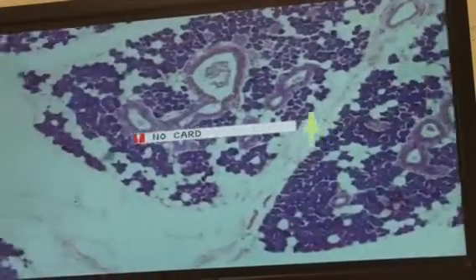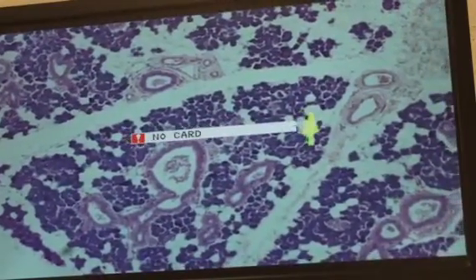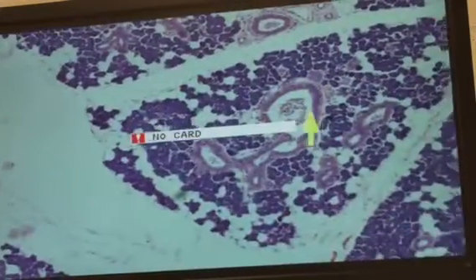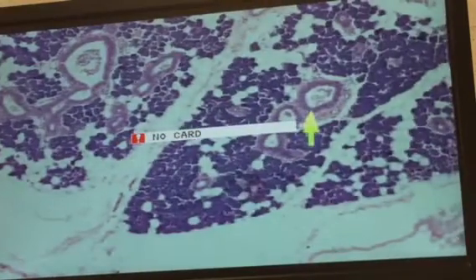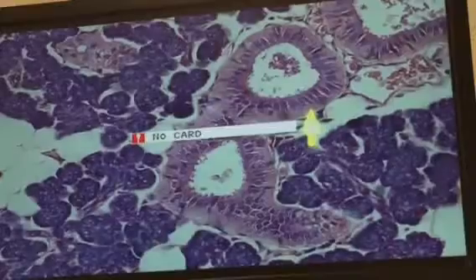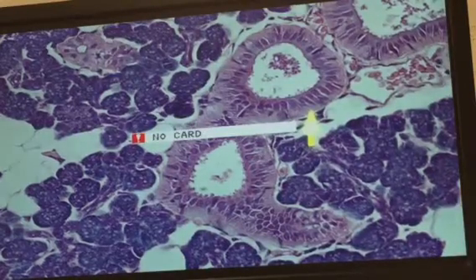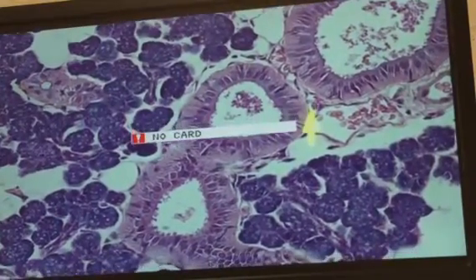and just take a quick scan, we can see that there is some intralobular fat. See a rather extensive ductwork in here. And right here we've got a striated duct, which is intralobular. And as we go down and take a closer look at that, you can see the basal striations in that duct. And we also see a number of vessels around the area, capillaries.